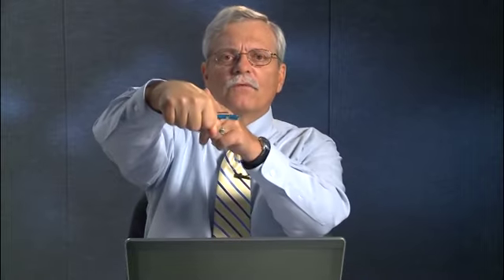Now it's kind of hard to see, but on this drawing there's a little yellow button. That little yellow button is actually a pin. Now, the pin sticks out from the arm. It goes into a keyhole on the top of the carousel. That's what allows it to turn the carousel. So when the arm comes down, that arm comes down into the hole in the center of the carousel, and then it rotates until the pin drops into the keyway. Once it drops into the keyway, it's sensed by this sensor, marked number 5, and now the machine knows it has engaged the carousel and it can begin looking for the proper carousel.